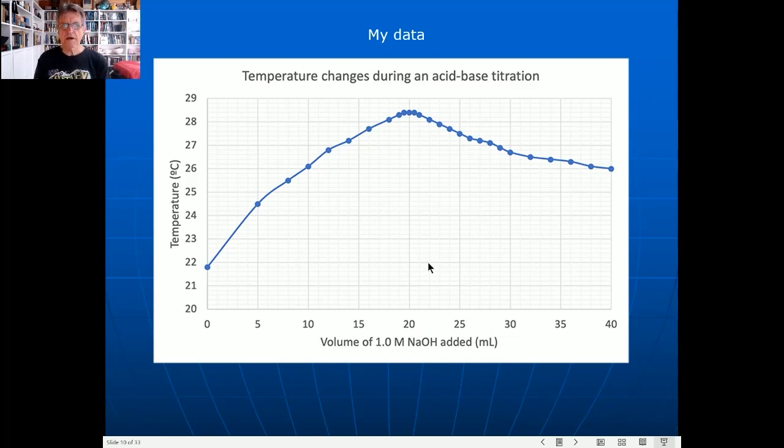Okay, now the way you judge the end point is as being where the maximum temperature was, obviously it's somewhere along those 3 dots. They're the maximum. The trouble is they're all the same temperature. So how do you judge it? You can take the middle one, which was exactly 20.0, but the way it's normally done with these sorts of titrations is to draw lines up each side and see where they meet.